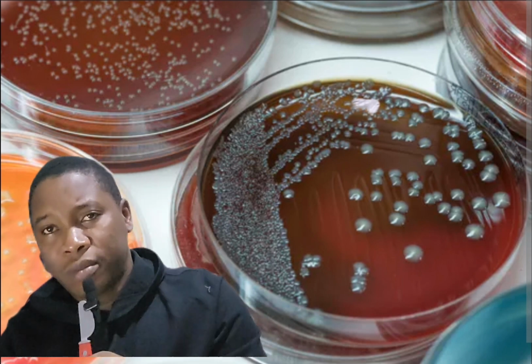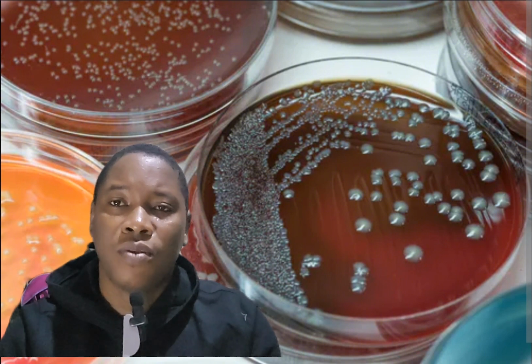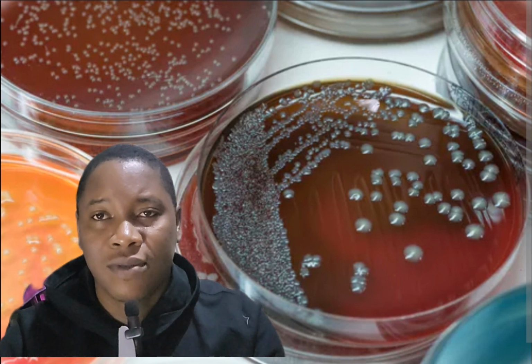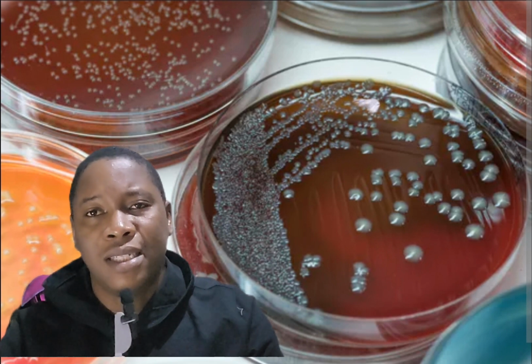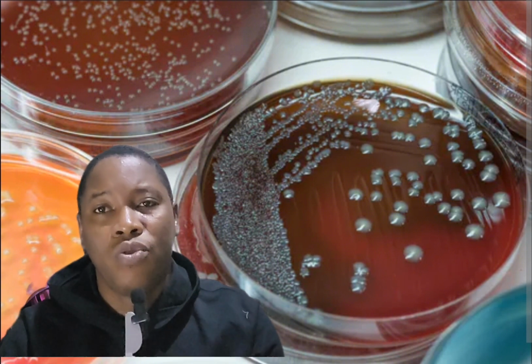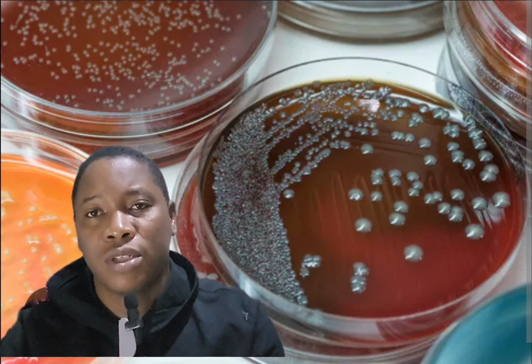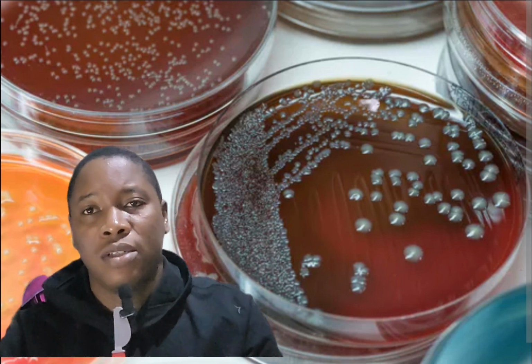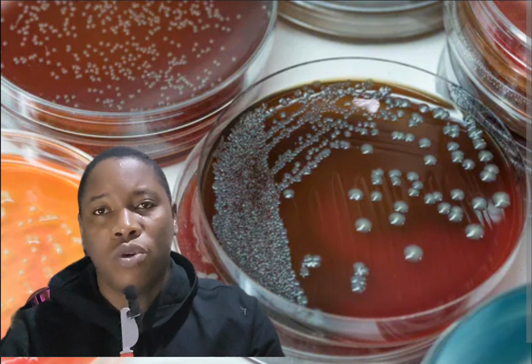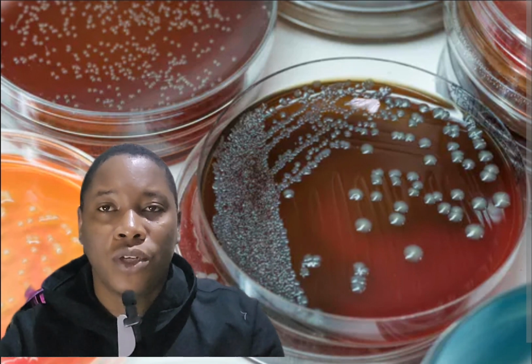And like I said, we have different samples. You can have environmental samples, you can have samples from soil, from water, from fecal matter, from food, from plants, from animals, from flesh. Different sorts of places where you can get samples from. You even do swab samples. And what are swab samples? You have a piece of cotton wool that you've soaked in either distilled water or normal saline, and you use it to gently rub on a surface because you want to take the microorganisms from that surface and go and culture them in the laboratory.